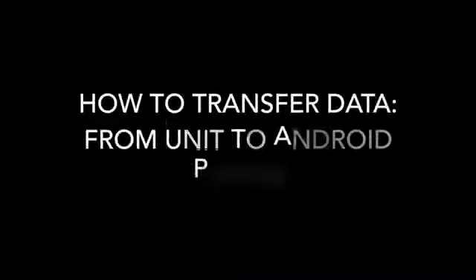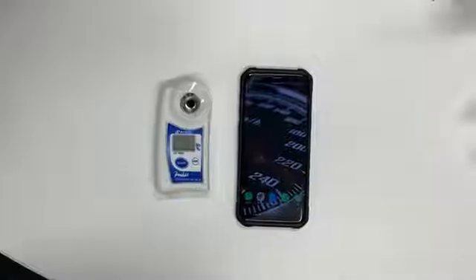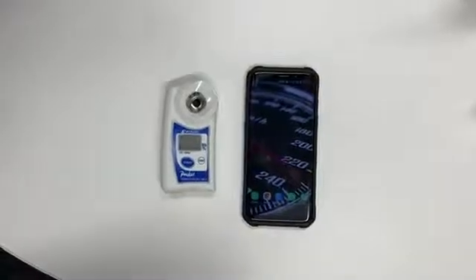The majority of our digital handheld and palette style refractometers will have this new NFC feature.